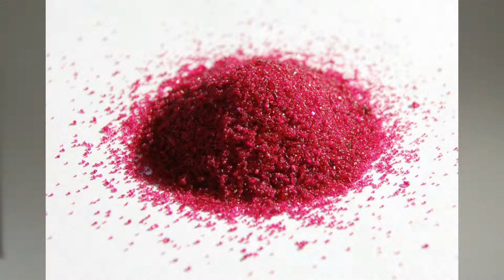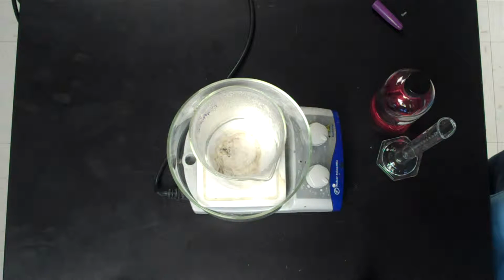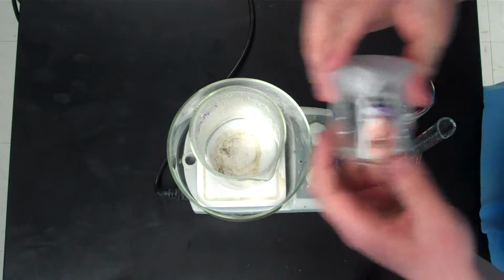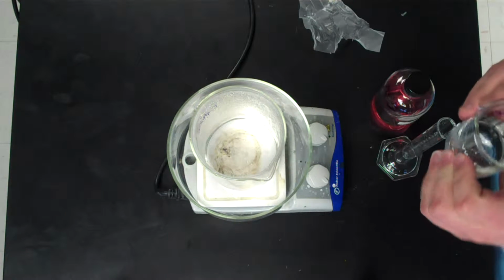The second one that I'm going to talk about that involves hydrogen peroxide is called a pink catalyst. It's a cobalt chloride solution, and as you can hopefully see, it's a very nice pink color. We're going to add it to a solution of sodium tartrate, which is C4H4O6 2-. For us, it's sodium tartrate, which means there are two sodium atoms giving a plus charge to the tartrate anion. We heat that up on a hot plate, as you can tell. We warm it up a little bit so that the reaction takes place, and then we pour in some hydrogen peroxide.